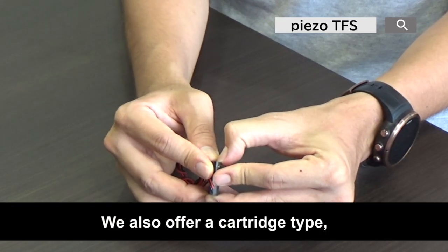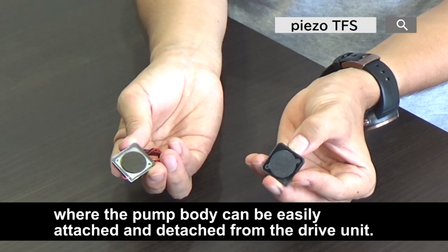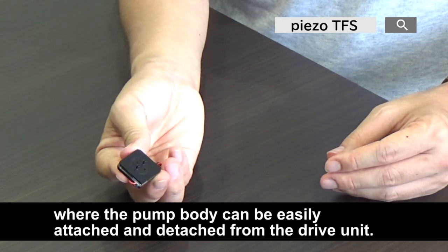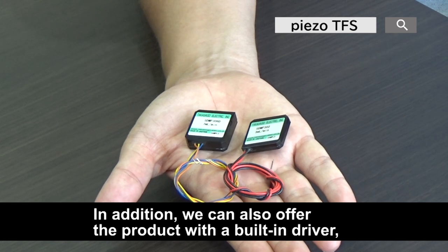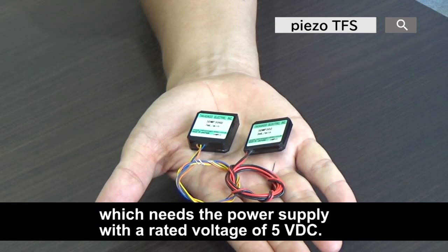We also offer a cartridge type where the pump body can be easily attached and detached from the drive unit. In addition, we can also offer the product with a built-in driver, which requires a power supply with a rated voltage of 5V DC.